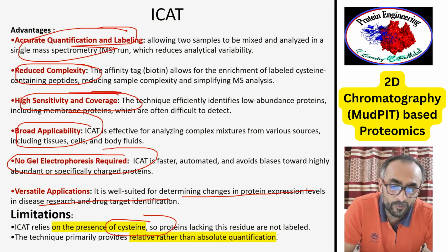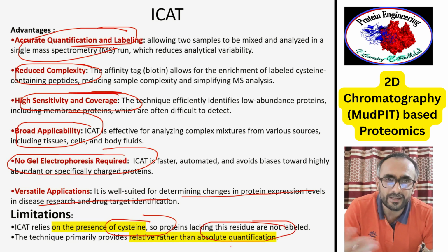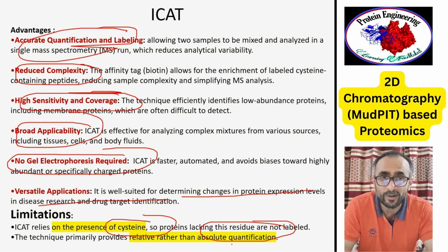The technique primarily provides relative rather than absolute quantification. The quantification of protein is also relative. It's not absolute quantification what you get in ICAT.